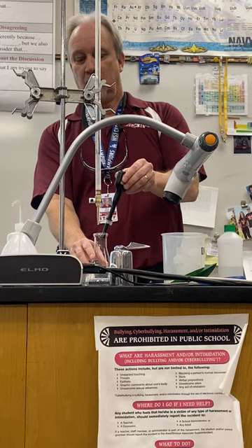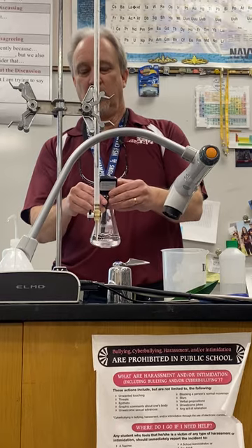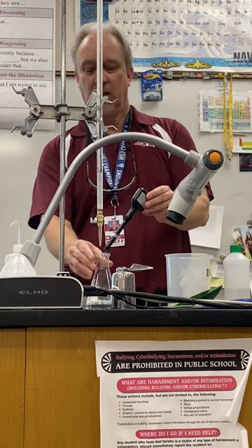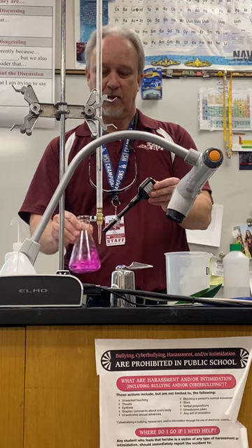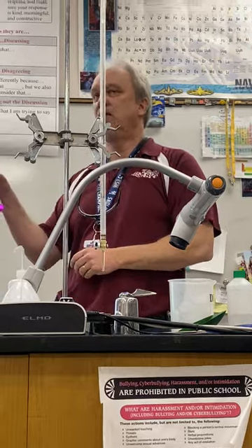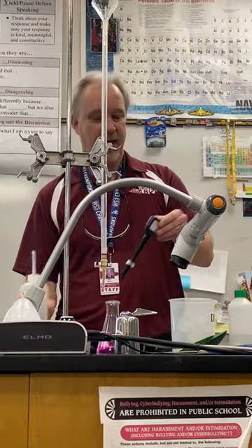I could take this out, do a couple data points so I could read how much liquid I use. Now it's at 4.5. I could keep going a little bit. Past the equivalence point, you wouldn't want to do it like that. I'm just doing it fast for demonstration. But you're going to want to get the pH at the equivalence point as well. Okay? And then you're done with that.